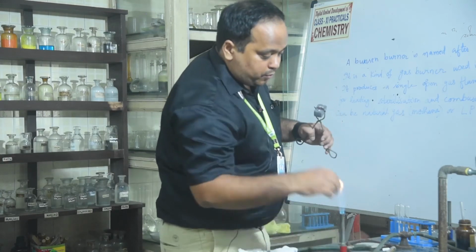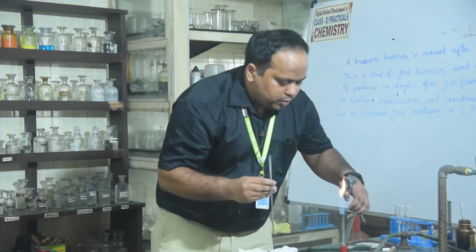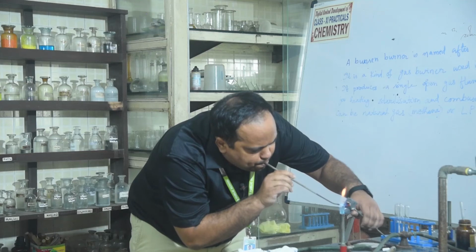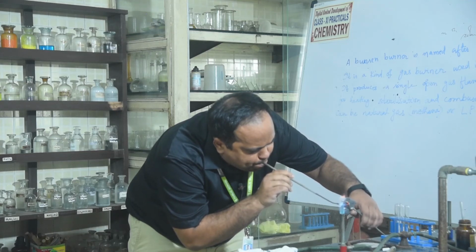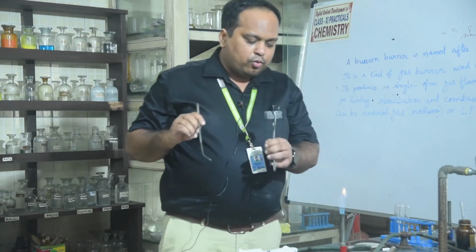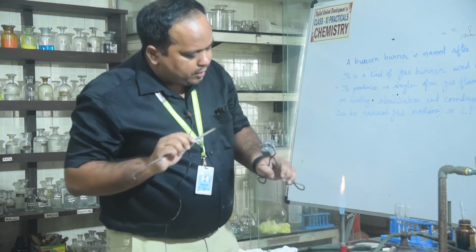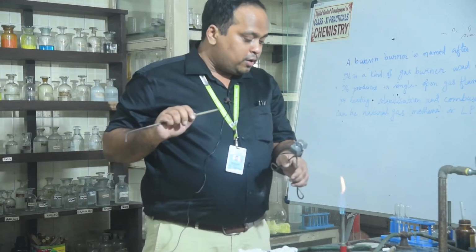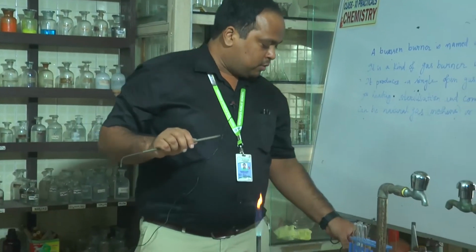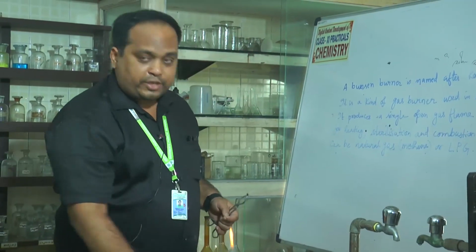So if you are getting blue color, light blue color is coming, but not proper blue. This light blue color is coming. Whenever you are getting blue color, that means aluminium is present. Got it, all of you? So this is your charcoal cavity and cobalt nitrate test.